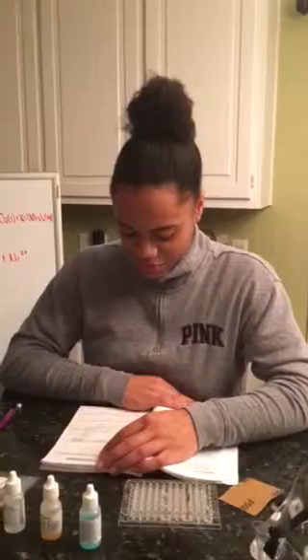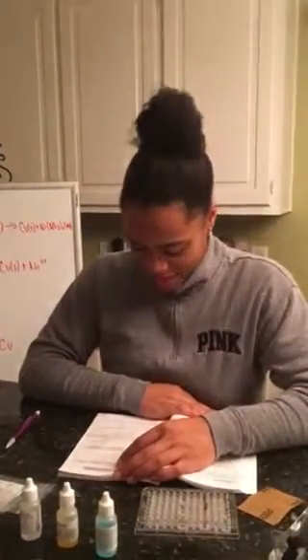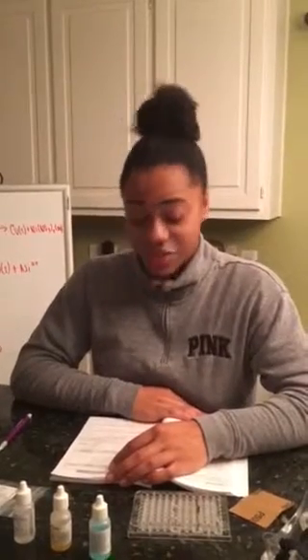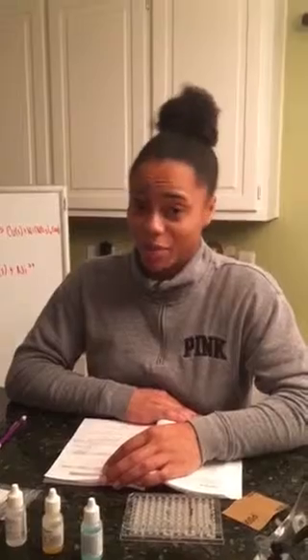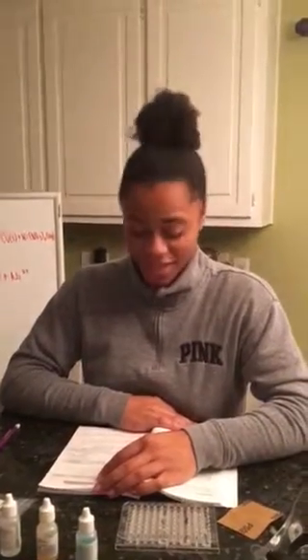So also for this experiment, I realized that the zinc did reduce, and the metals that acted as the reducing agents were the copper and the iron. Or the zinc nitrate was reduced.